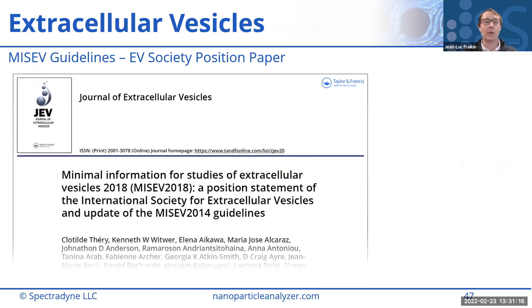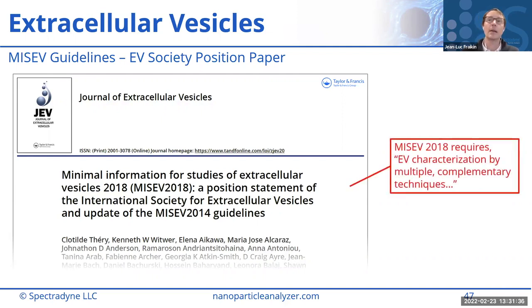And again, you don't have to take my word for it. This is enshrined in the EV space by the MISEV guidelines. These are a position paper that gets revised every few years by the International Society of EVs. And it specifically calls out that EV characterization should be performed using multiple complementary techniques, right? They're recognizing this problem and encoding it into the boilerplate for EV experiments. And this is definitely a great step in the right direction.